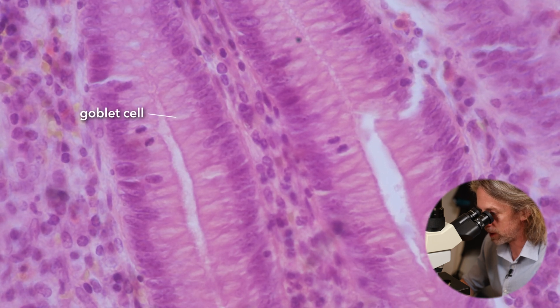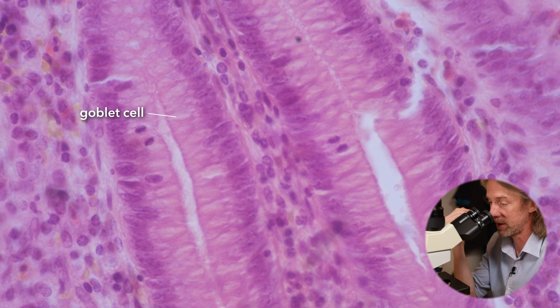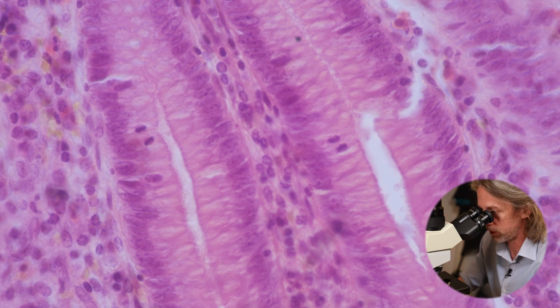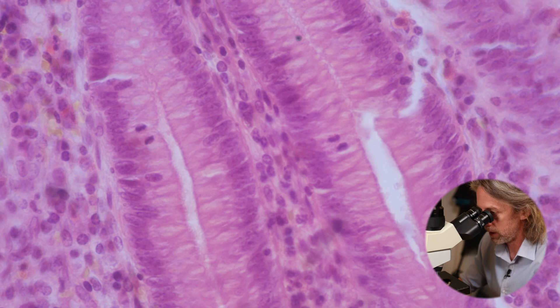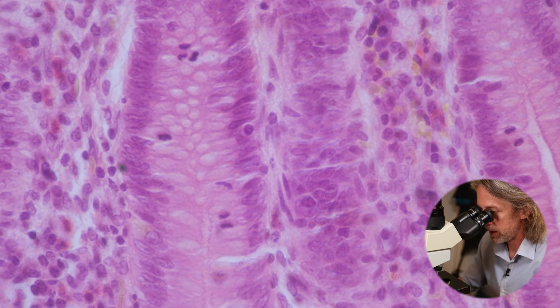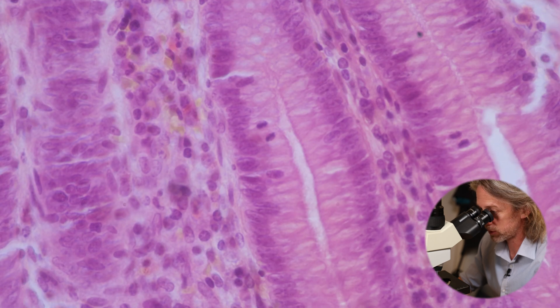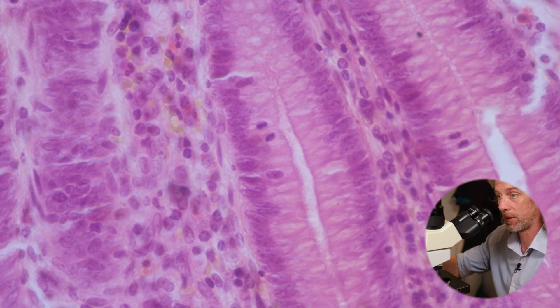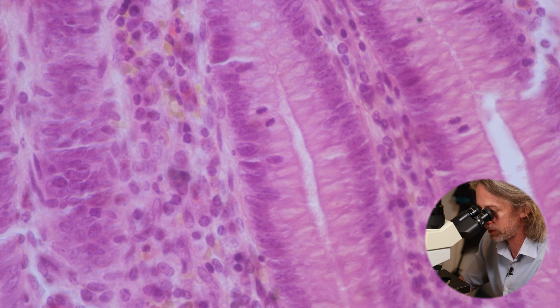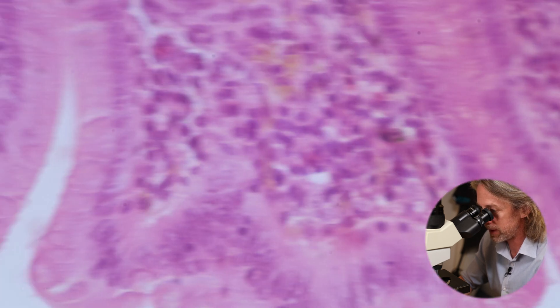Those crypts are filled with goblet cells. We'll also find in there the same sorts of cells we saw in the large intestine — stem cells, enteroendocrine cells. Goblet cells look the way they do because they're filled with mucin; they produce mucus, which in the large intestine helps everything move along. For the whole gastrointestinal tract it helps lubricate, move everything along, and protect the epithelium.